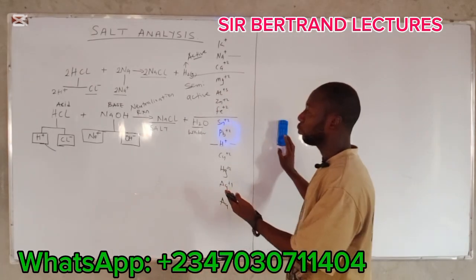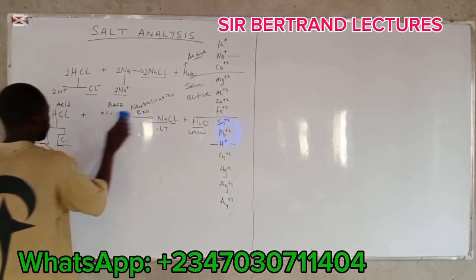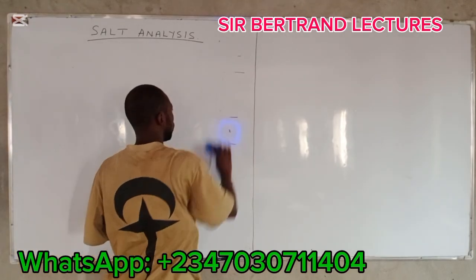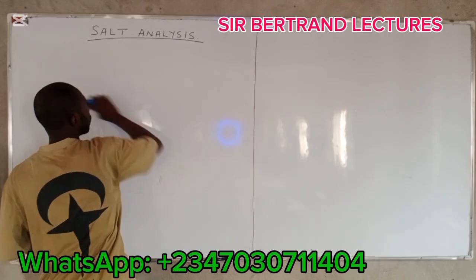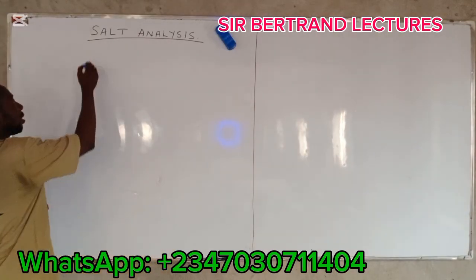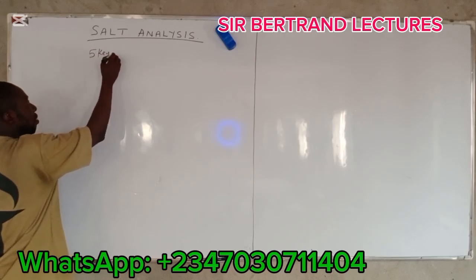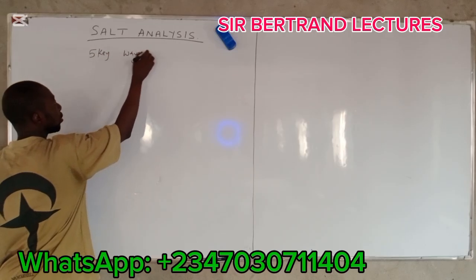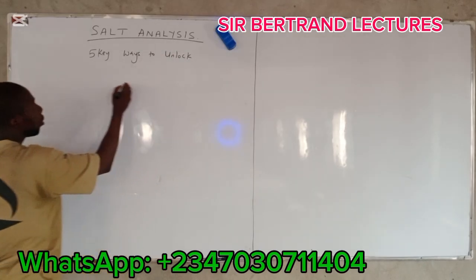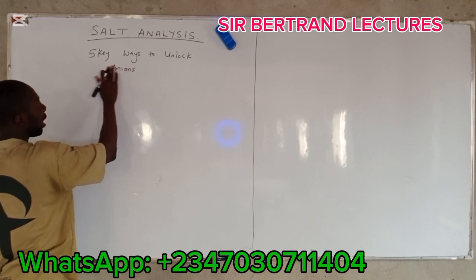I believe you are through with this on the board. All right, so I wipe it. We are going to look at the five key ways to unlock anions.